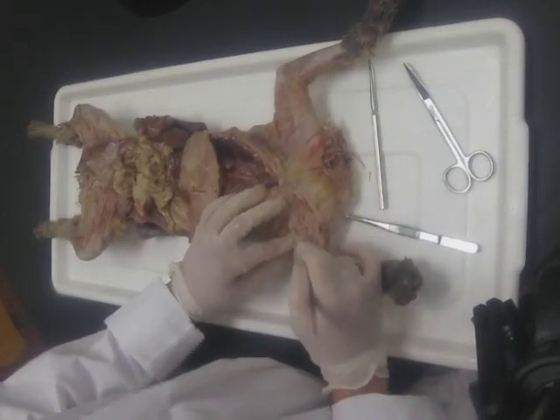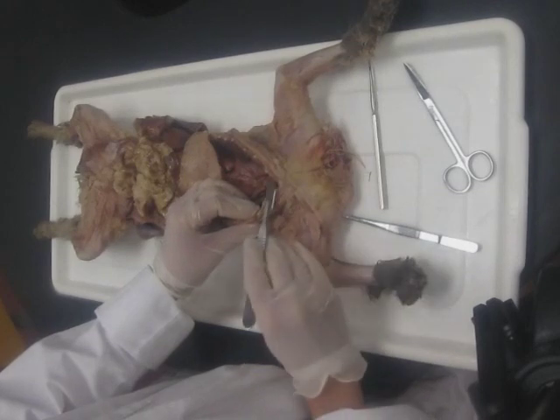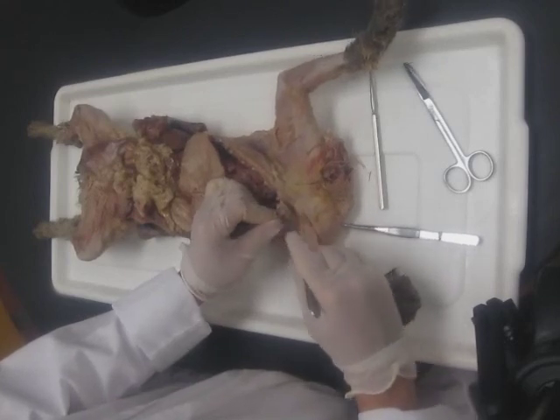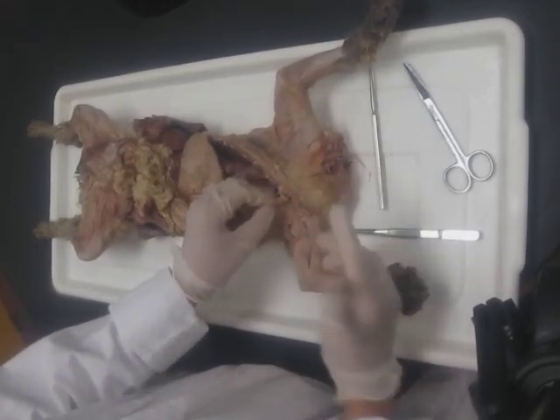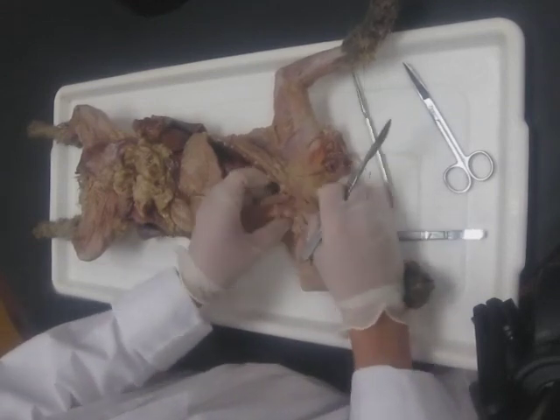Once you start seeing those vessels, be very careful going through this tissue. We need an open passageway between the thoracic cavity and the arm, so we're going to start going through the muscle of the rib cage and gently go between the tissue and the costal cartilage of the ribs to open up this passageway.